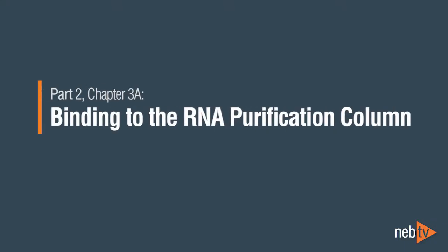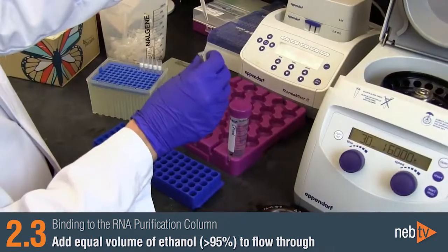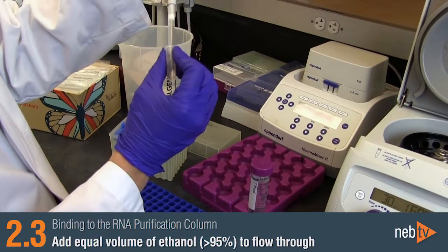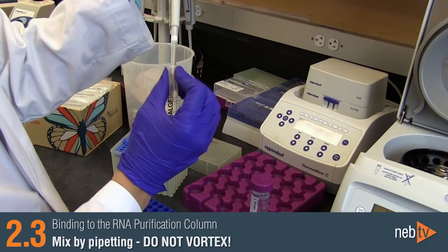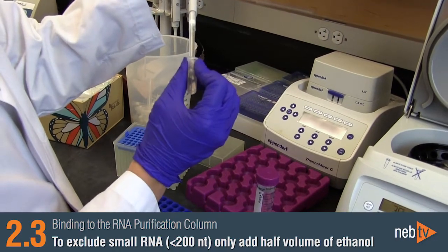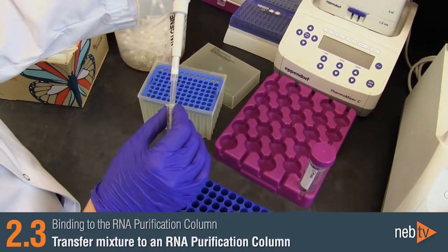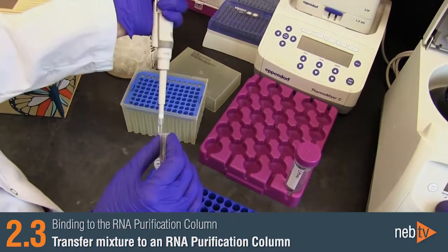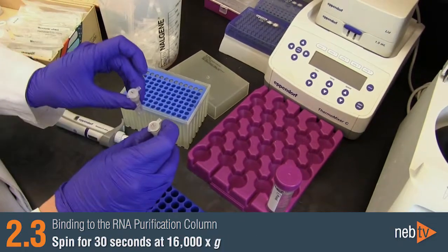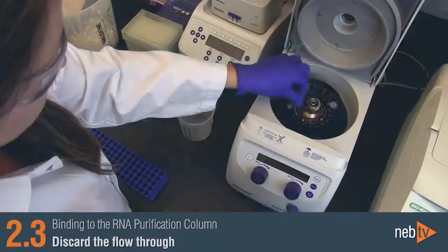Binding to the RNA Purification Column. To prepare your RNA for binding, add an equal volume of ethanol, greater than 95%, to the flow-through from the previous step and mix by pipetting. Do not vortex. If you want to exclude small RNAs less than 200 nucleotides, only add half the volume of ethanol. Transfer the ethanol-sample mixture to an RNA Purification Column (the column with the dark blue ring) and spin for 30 seconds. Discard the flow-through.